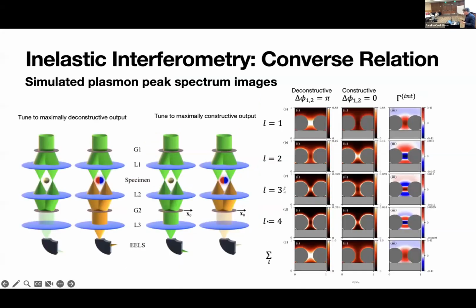So here's the model using the discrete dipole model. One thing we want to press on is there's one particle. We're going to have one particle, but we're going to scan our two probes past it. So when you normally image in a scanning TEM, you have an image, let's say this particle, and you scan the probe. So it's like convolving a delta function with whatever you're looking at.